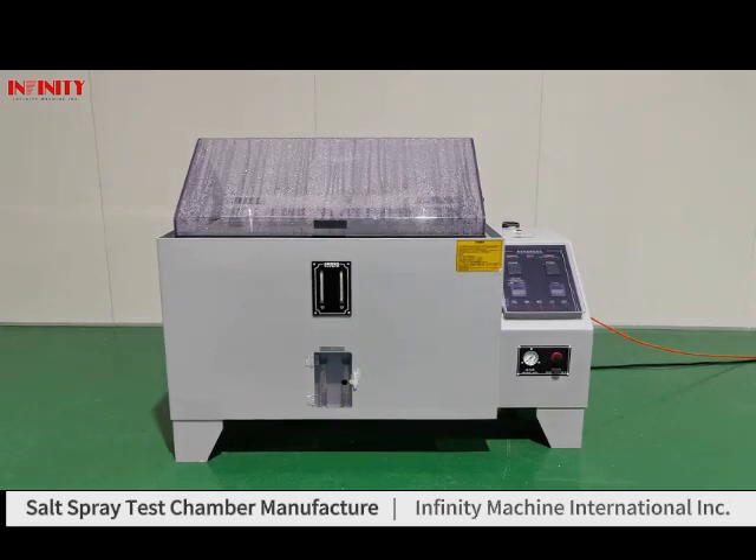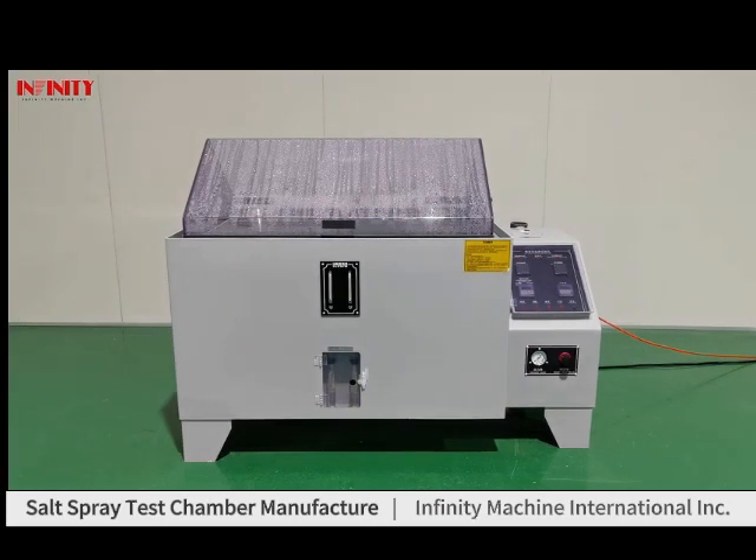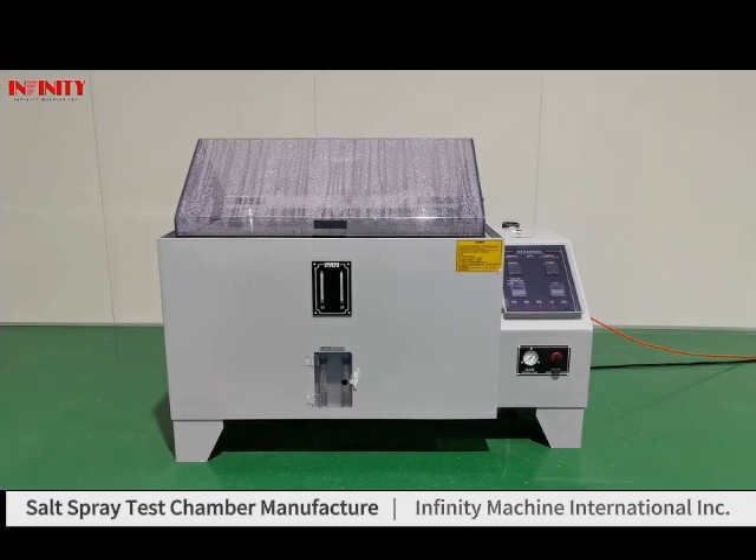This machine is a salt spray test chamber. Today, we will introduce how to operate this machine. Firstly, we will introduce the structure of the machine.